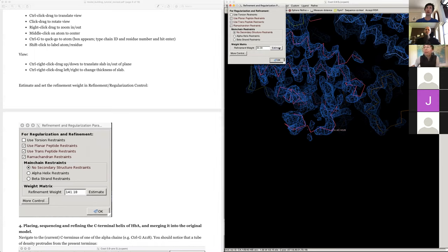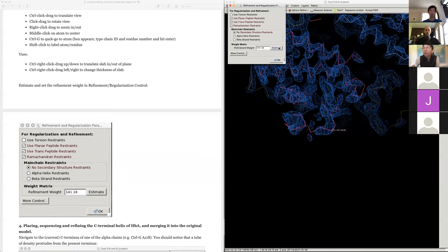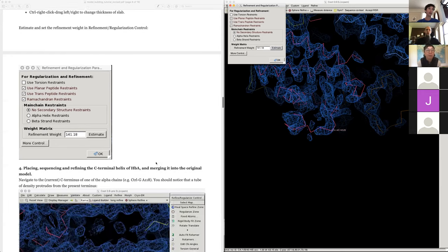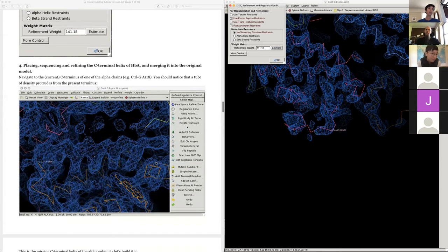You can do an auto-estimation of the refinement weight — I'd take that as a starting point and adjust as needed. The lower the weight, the more weight on protein geometry (prior knowledge); the higher it is, the more weight on the map. If you reduce it to zero you're basically just doing a simulation with no map contribution. If it's really high your atoms will become unbonded and explode. Find somewhere in the middle where map and model are happily playing together.